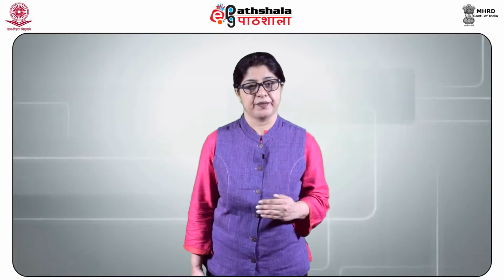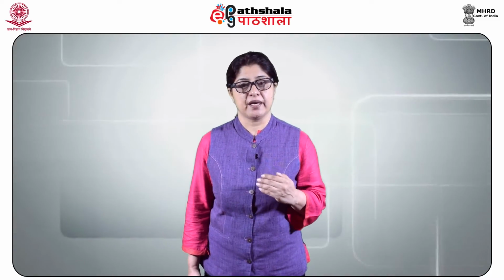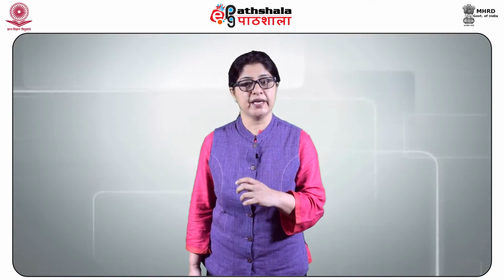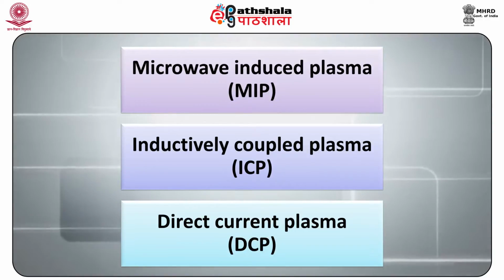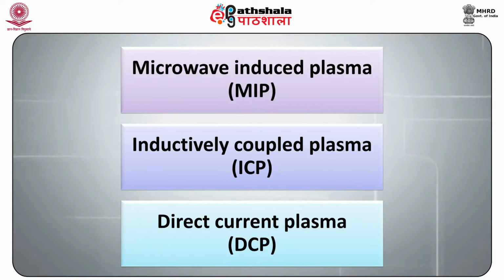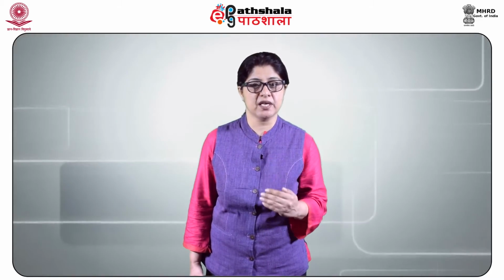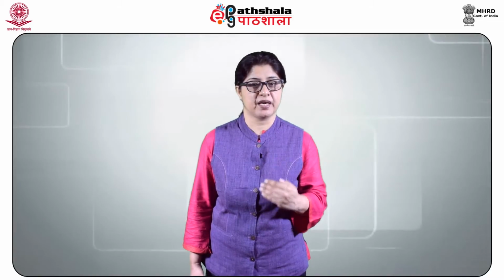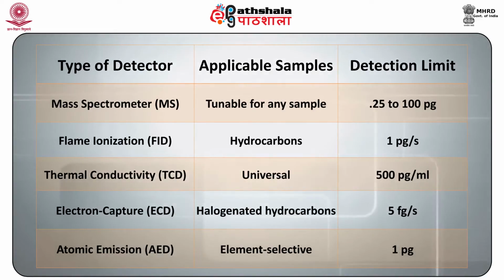Atomic emission detectors (AED) are the latest embellishments to the gas chromatographer's arsenal. They are element selective detectors that utilize plasma, which is partially ionized gas, to atomize all the elements of the sample and excite their characteristic atomic emission spectra. There are three ways of generating the plasma: microwave induced plasma (MIP), inductively coupled plasma (ICP), or direct current plasma (DCP). MIP is the most commonly employed form and is used with a diode array to simultaneously monitor the atomic emission spectra of several elements. AED is an extremely powerful detector that has wide applicability. The different types of detectors have been summarized here in the given table.